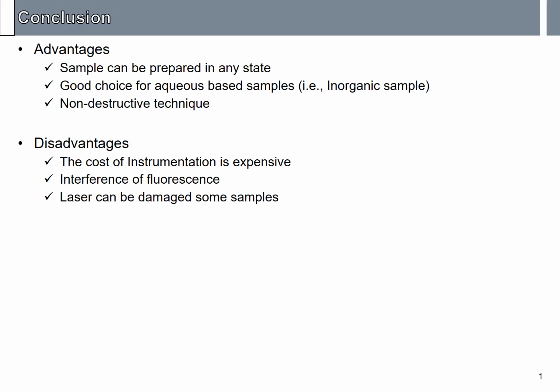But it also has some disadvantages: it costs really high compared to other instrumentation, it suffers interference from fluorescence, and if you choose a very strong laser, it can damage some of your samples as well.